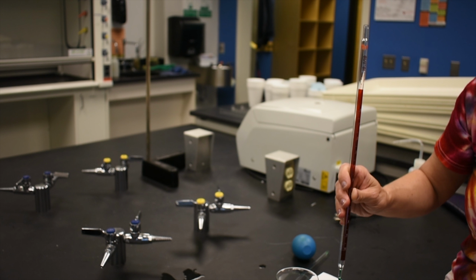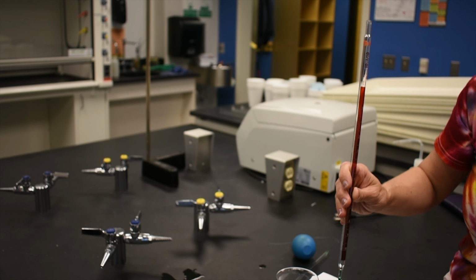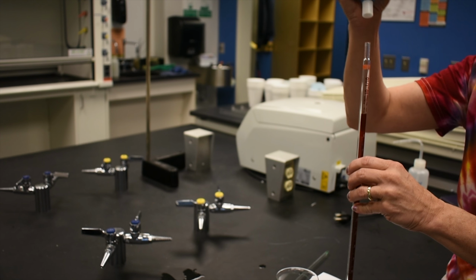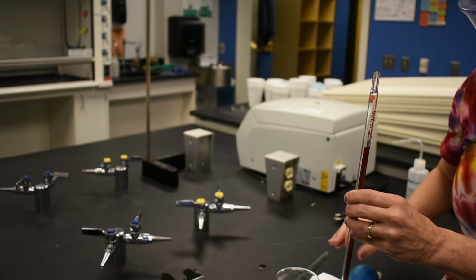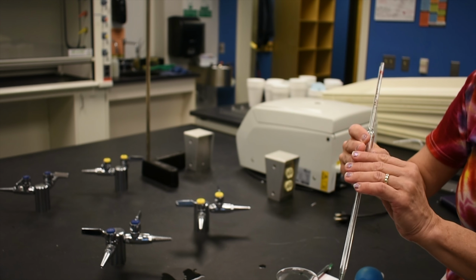This is exactly how the pipette is designed, and if I had started at the 0 mark, this would be 10 milliliters of solution. What you don't want to do is shake your pipette or place your pipette bulb on the top and squeeze the rest out, because then you will have more than 10 milliliters. All right, we're going to set this pipette down so it's somewhere safe.